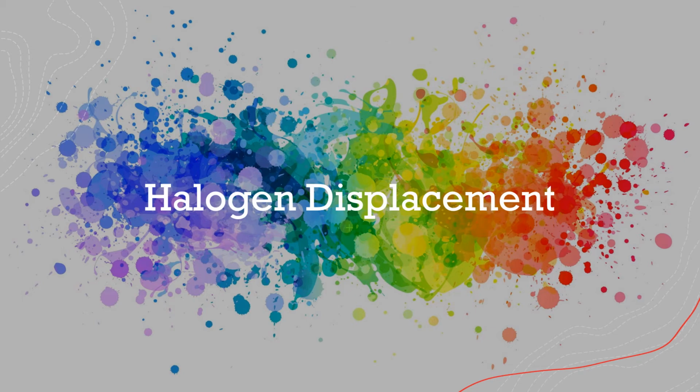Hi everyone, today we're looking at halogen displacement. So in the last lesson we studied halogens, the fact that they are in group 7, that they are all different colours and that they get less reactive down the group. Now all those things are really important for what we're doing today.